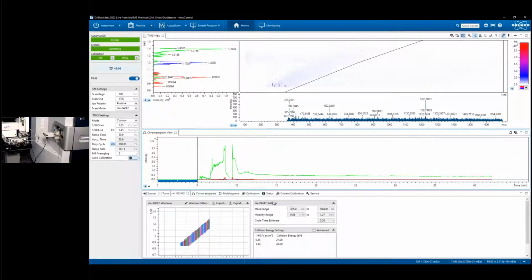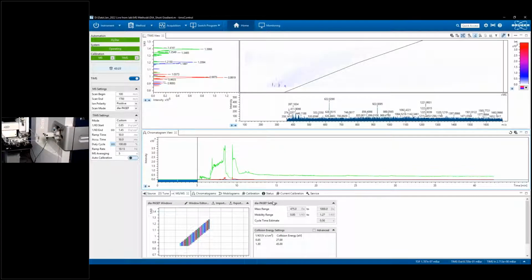the mass spectrometer, right? Because obviously one of the things that we need to do, I would do typically at the start of every sample list, or maybe once or twice a week, is to calibrate the mass-to-charge scale, but also the ion mobility scale, right? Because that's also a key part of the way that the TIMS process works. So calibration of the timsTOF is really very straightforward.